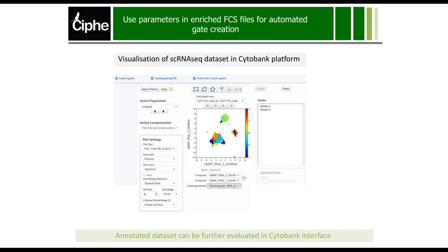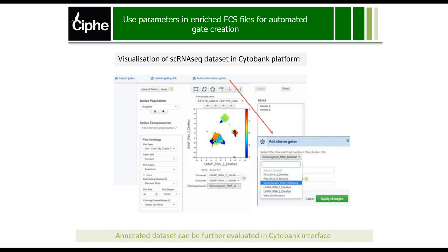And what I would like to do is basically here I project Hervé data, so that has been enriched into another software not available in Cytobank, but I can visualize that, and then I see my color code that fits to cluster annotation. But what I would like to do is to calculate frequencies of cells within each of these clusters.